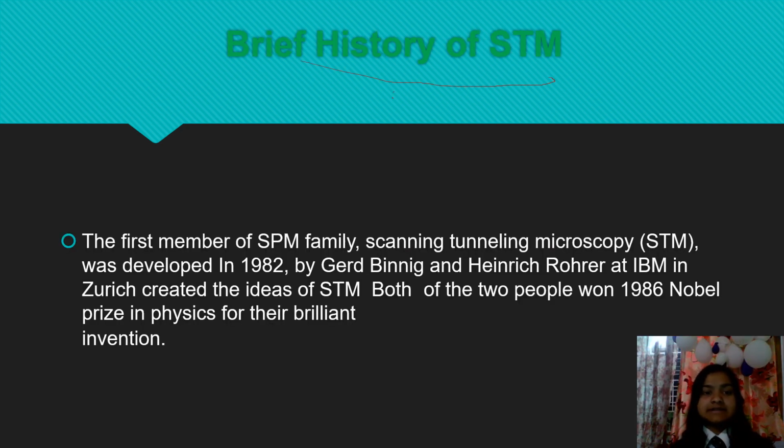Brief history of STM. The first member of the SPM family, the scanning tunneling microscope, STM, was developed in 1982 by Gerd Binnig and Heinrich Rohrer at IBM. Both of them won the Nobel Prize in 1986.